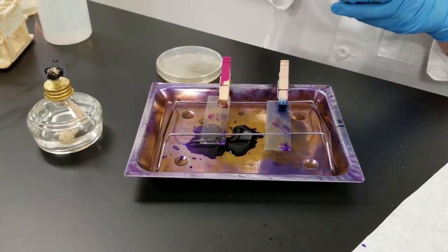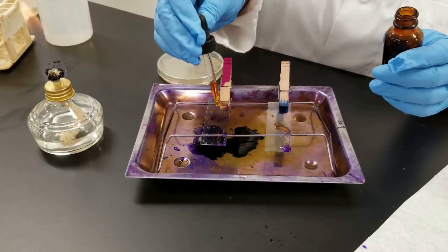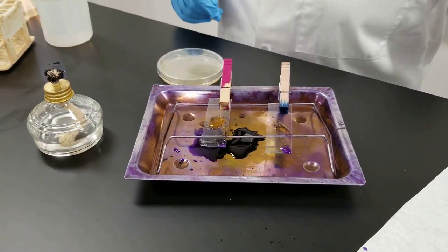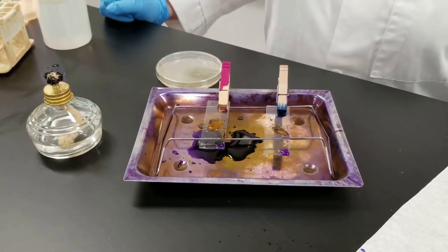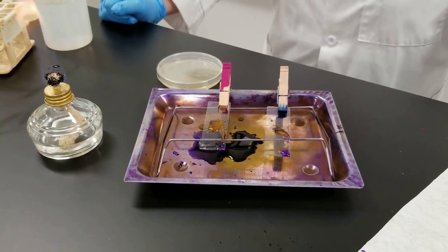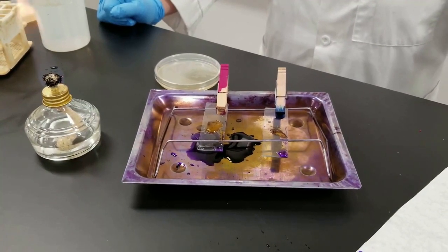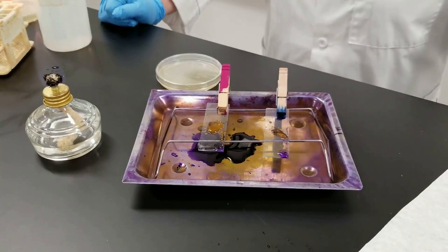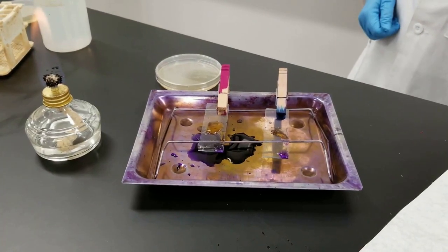Now the second step is to add Gram's iodine. So I'm just going to flood the area with that. And that stays on for 1 minute as well. This is a mordant. It's going to help fix that crystal violet and help it stabilize in the cell wall. So I say the cell wall is different between two major classifications of bacteria. The gram-positives, their cell wall is much thicker than the gram-negative cell wall. The gram-negatives have an extra outer membrane as well, and these differences in the chemical compositions are what make the staining process different in the end.